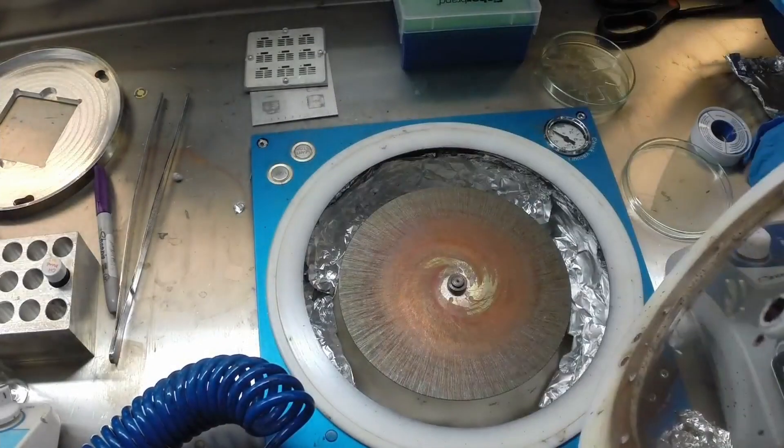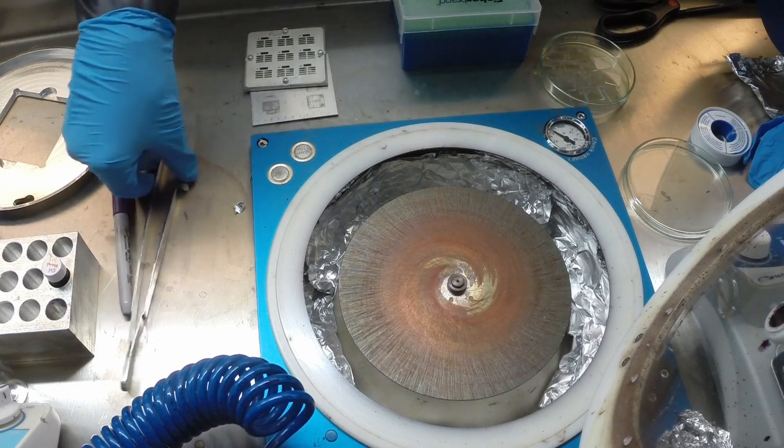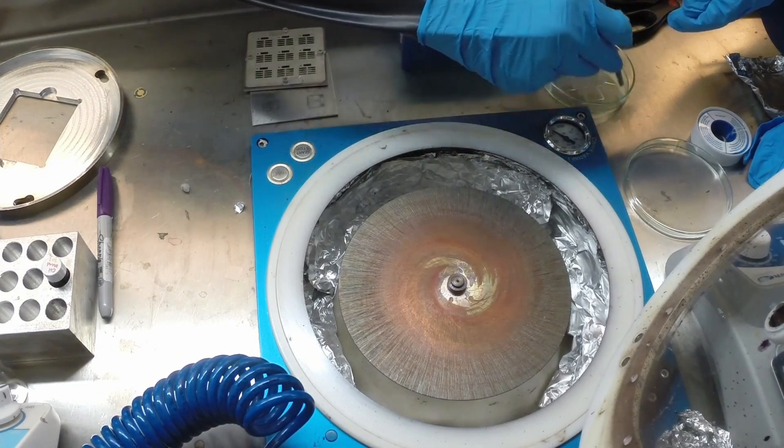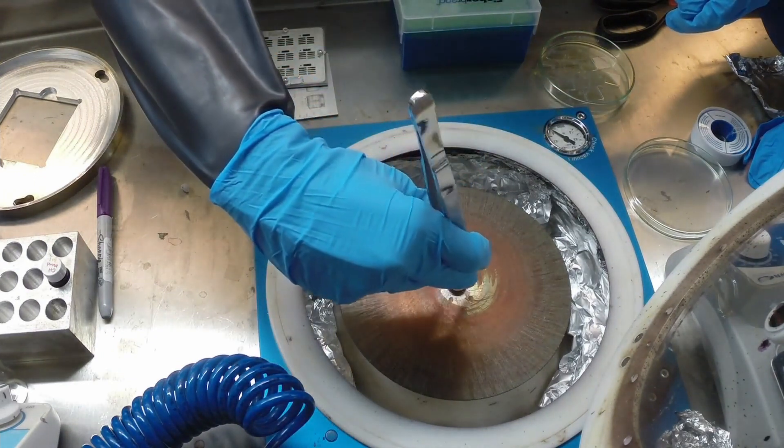To begin spin coating onto glass ITO substrates, we'll open the lid, place a substrate on the chuck, and press the round vac button to turn on the vacuum.